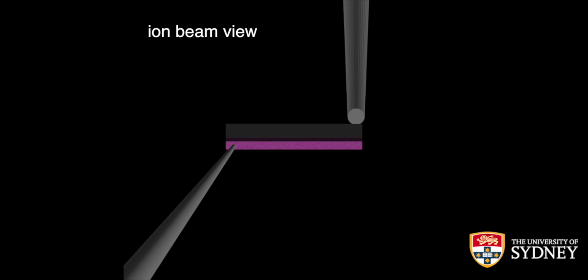And that is very important. So if you do electron or ion beam assisted deposition for structural welds, or for any kind of weld really, geometry is everything. Having the right deposition geometry will make a difference on whether your weld is going to last or not. Deposition conditions also have a great influence, but the most basic thing you need to get right is the geometry.